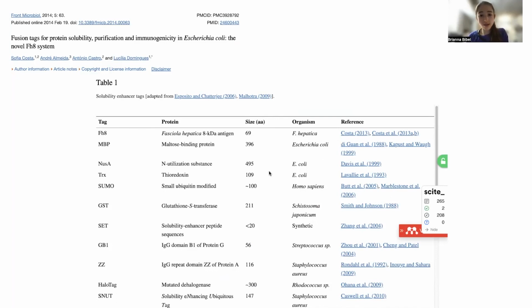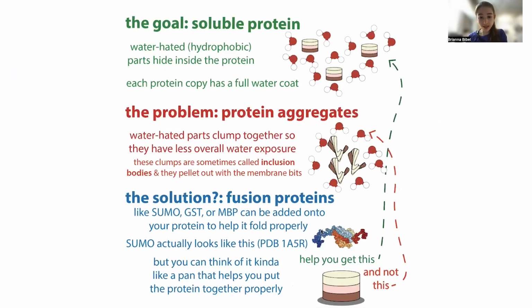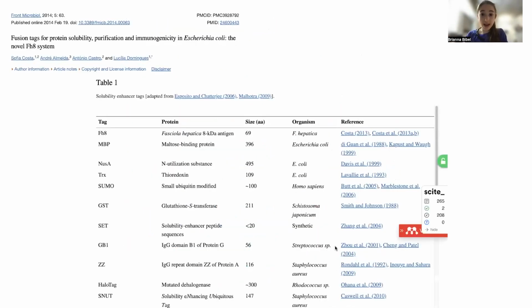The one that I've used the most is this SUMO tag, this small ubiquitin modified, which is this protein. It's like ubiquitin, and it actually gets added onto proteins in a manner similar to ubiquitin. It's a modification that can get added onto proteins naturally, post-translationally after the protein's made. But in this case, we're getting it made and attached to our protein as our protein is getting made. And this is going to help it by serving as this fusion partner. But it's also going to add a lot of bulk. In this case, the SUMO is about 100 amino acids.